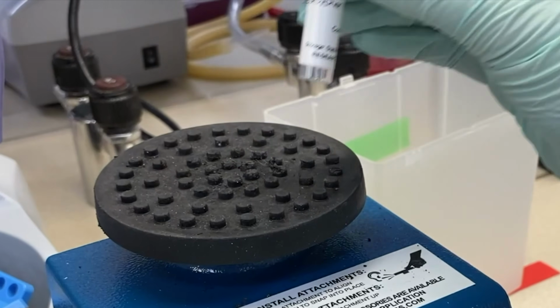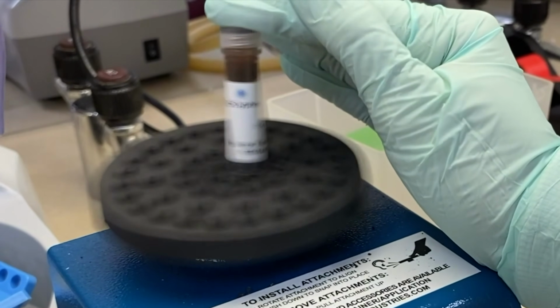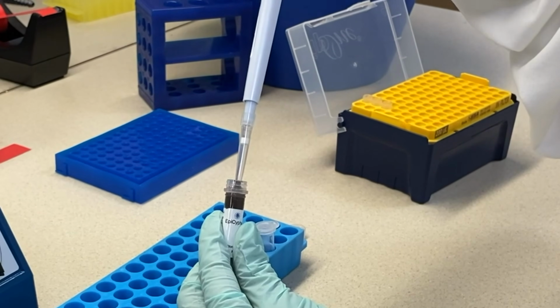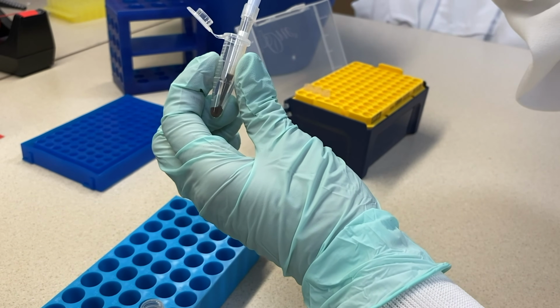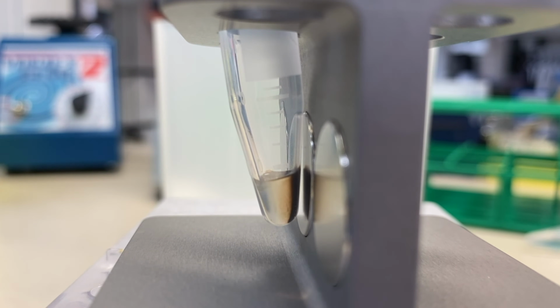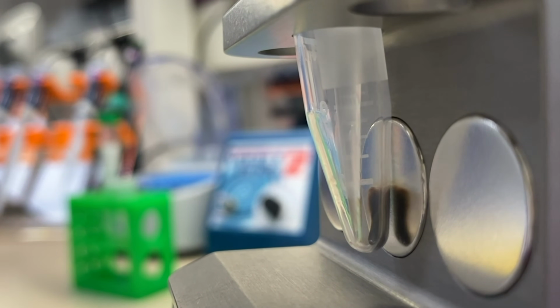Resuspend the Con-A bead stock by gently vortexing on a 6 or 7 setting, or gently inverting the tube a few times. Give the tube a quick spin to remove any material that might be in the cap. Transfer the appropriate amount of Con-A beads for your number of samples to a 1.5 ml tube. Place the tube on a magnetic rack until the slurry completely clears. Take care not to touch or disturb the beads as you remove and discard the supernatant.